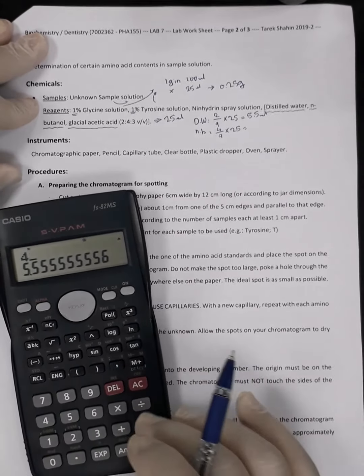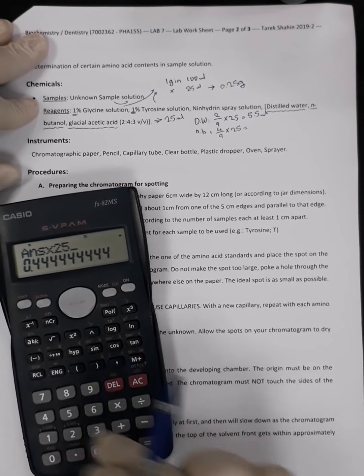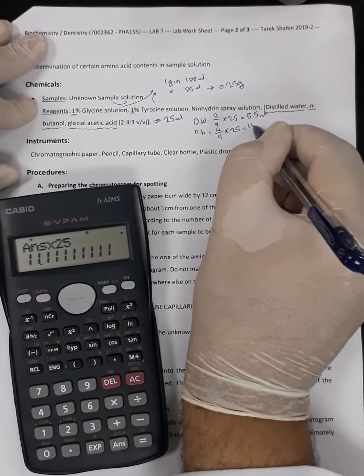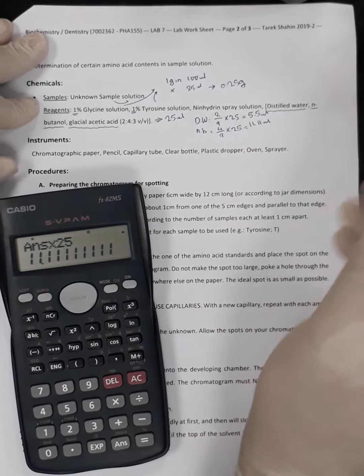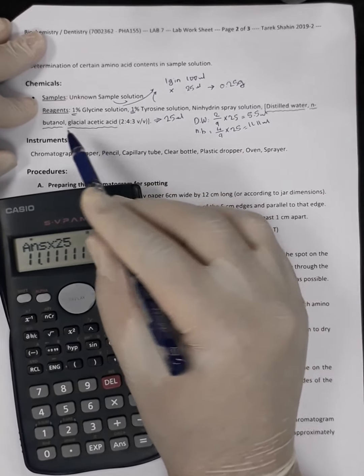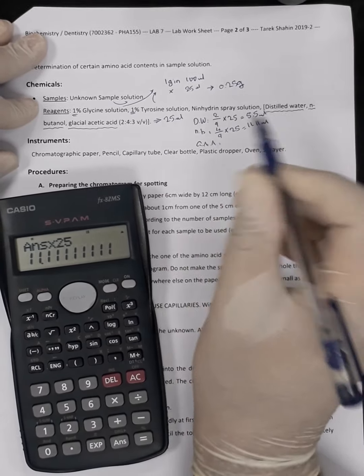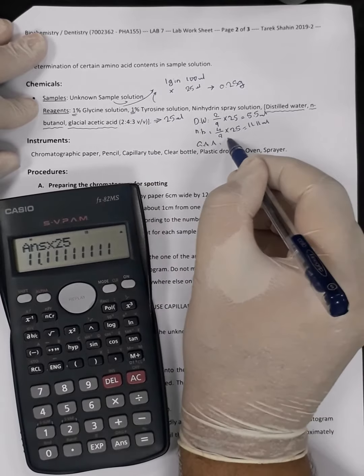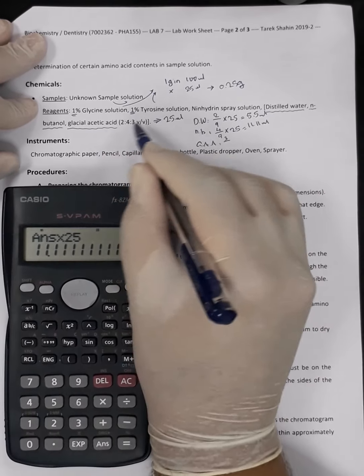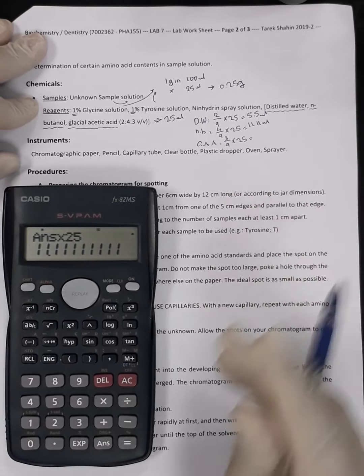So it's 4 divided by 9 and multiplied by 25. So it is 11.11 milliliter of N-butanol. Now we are going to determine the total volume of glacial acetic acid. The number of parts of glacial acetic acid is 3. We are going to divide it by 9 and multiply by 25 ml, the total volume of the solution.